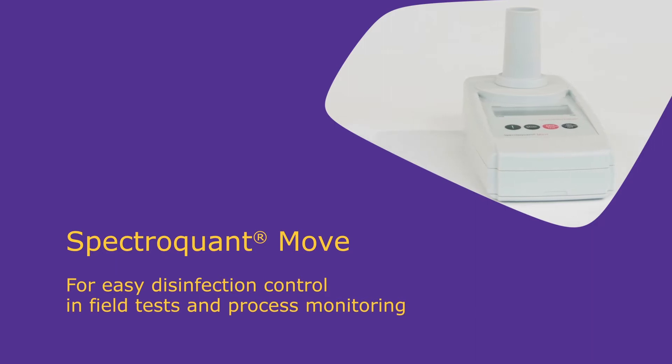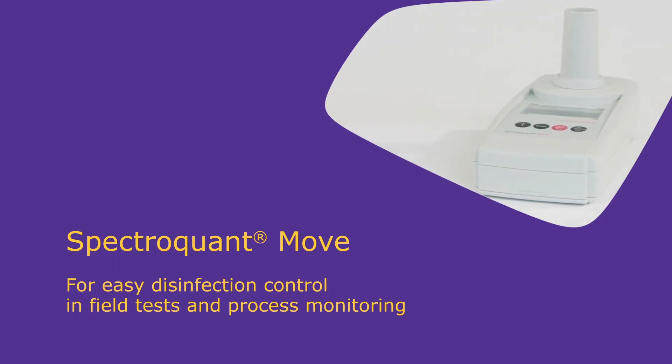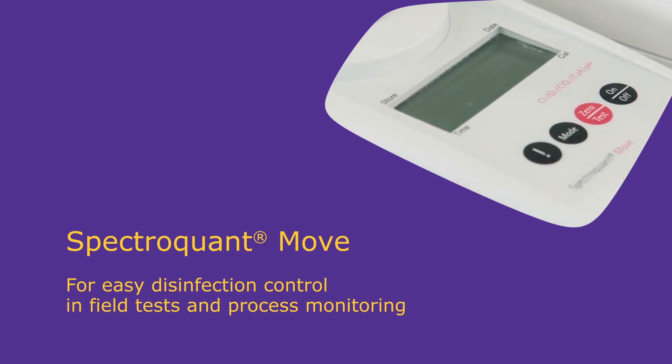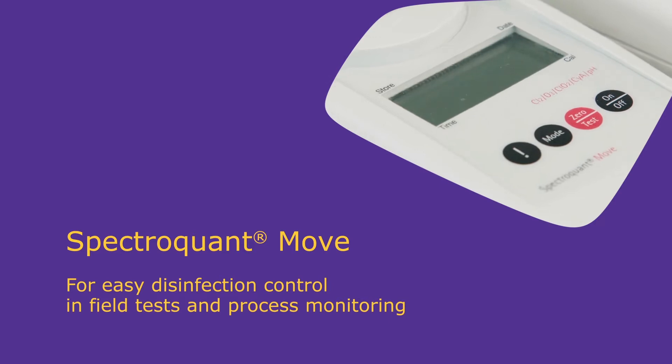The second MOVE instrument is designed for disinfection control and is used to measure chlorine, ozone, chlorine dioxide, cyanuric acid, and pH, giving reliable and rapid results.